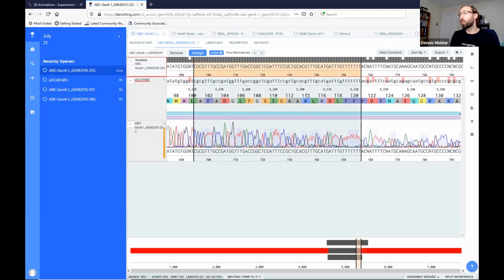So we have to design a new primer. Probably I'd design the primer somewhere around here. This primer would be the new sequencing primer, and then a new sequencing read and a new reaction would start somewhere around here, allowing us to look at the rest of the sequence, okay? So that's a little bit about how you take a sequencing result, do an alignment, and then interpret the data, right? You need to look at the signal, the noise, and see what's happening, okay?